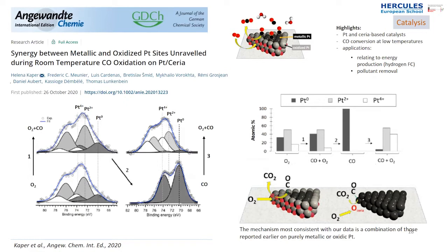And it was not known what is actually responsible for the CO oxidation that works so perfectly. Does the oxygen come from the ceria support or from the platinum oxide that is created around the platinum islands on the surface? So this group brought a powder sample.